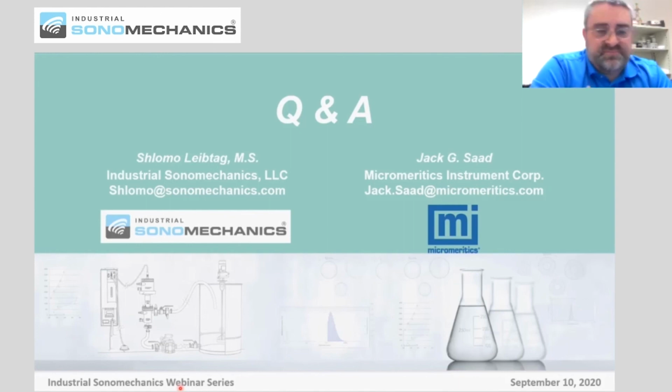But for the most part, either or. People like zeta potential because, especially for something like medications that you drink, it doesn't give it a syrupy taste. When you stabilize it with zeta potential, it's like a soda or coffee or something like that, where it's stabilized and suspended and it's not separating, and it flows like water. The more that it flows like water, the easier it is to drink.